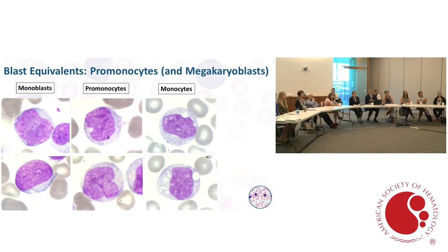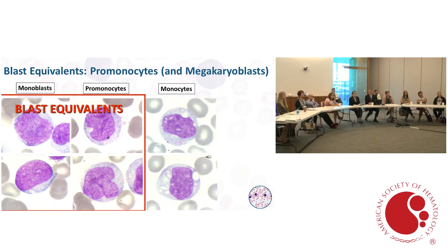And this is just the markers that are used. I think most of your flow labs will have this available. And do you do the flow in-house, all of you, or is it sent out usually, the flow cytometry? At the University of Minnesota, I'm sure you have your own flow lab, so it's done in-house.